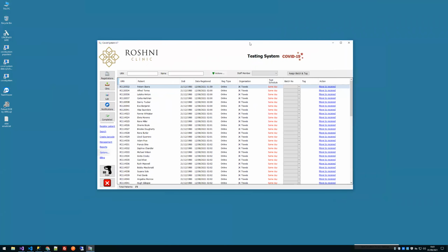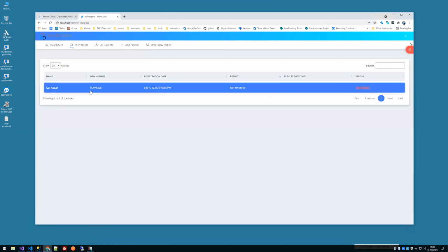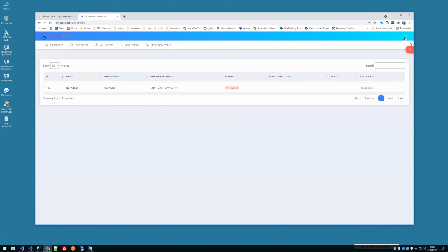But it's a juggling act, really, about auditing some of the key things that are important: orders, day 2, day 8 stuff, the day 5 stuff, text messaging. Someone wants text messaging to come into play, so they can receive a text and see on the website that they can see in progress, what's going on. So obviously, Gul Akbar is in progress at the moment. We've got no details logged against them. I've logged into the wrong org because this org doesn't have much.